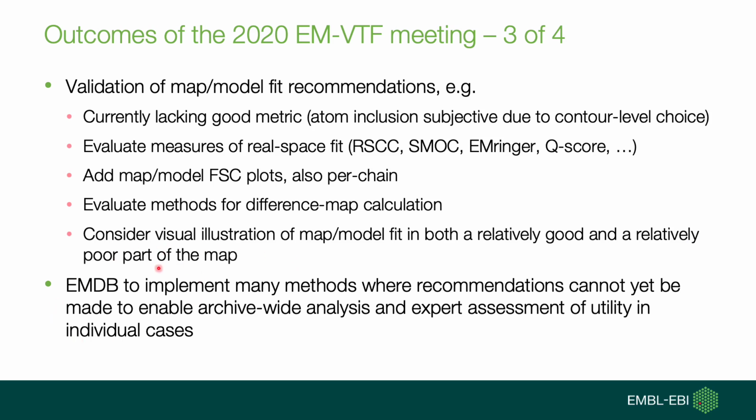So EMDB particularly was asked to implement many of these methods where no single program can yet be recommended, so that the whole archive can be run through these programs and analyzed, and also experts can look at how these metrics perform on individual cases that they are familiar with.